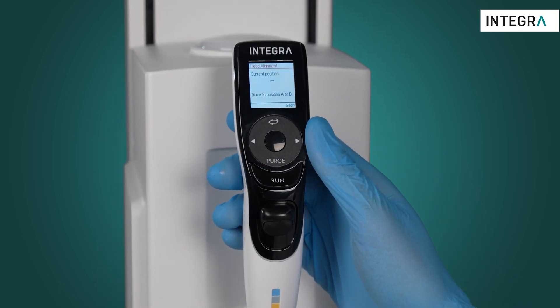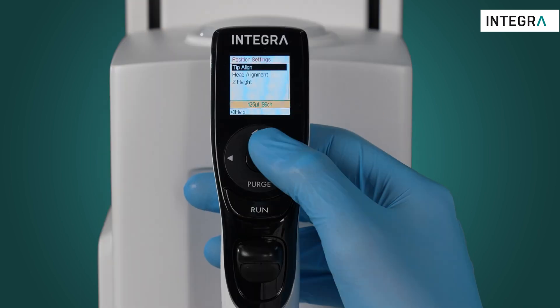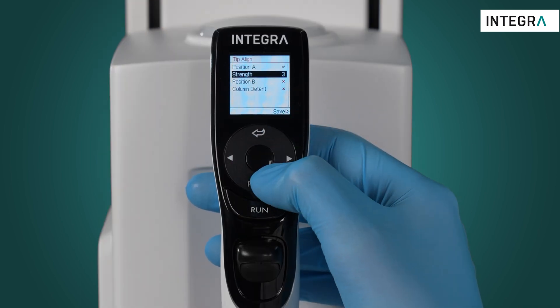This can be done in either position A or B. Once done, simply enter tip align and activate.